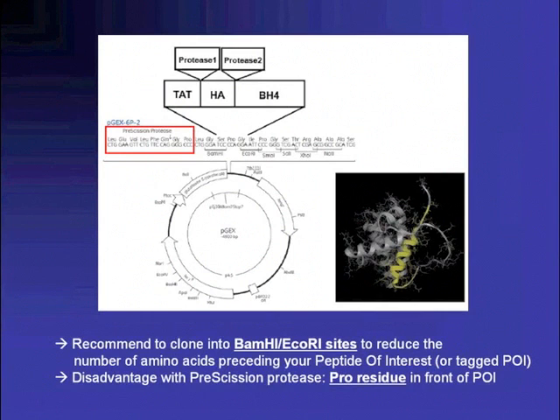It's a trial and error at that stage, but I would say definitely with hydrophobic sequences, they tend to clump together. So I would recommend to first optimize the conditions where they don't clump together, where you don't have the aggregates, maybe use a little bit of detergent. I'm not sure, but that might be an option.